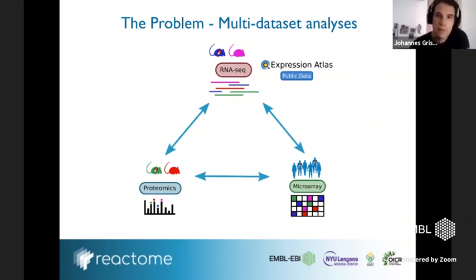And as soon as you look for other published data, at least that's what happened to me, you see, okay, wow, there's this cool other mouse study, they do the same thing, but they use transcriptomics. Maybe you want to compare to human data, but here this is an older, old microarray data set. And now immediately you're in this struggle, right, that you have to combine different omics technologies, maybe even different species, and you want to get one result. And that's what we try to solve with ReactomeGSA and made as simple as possible.